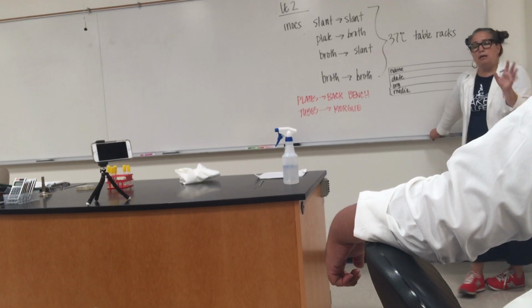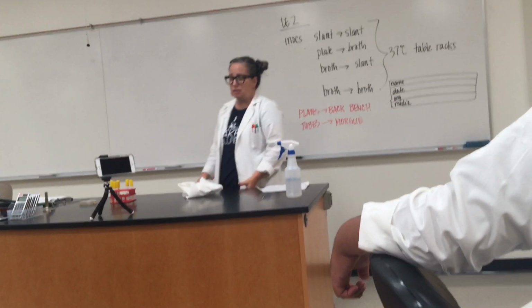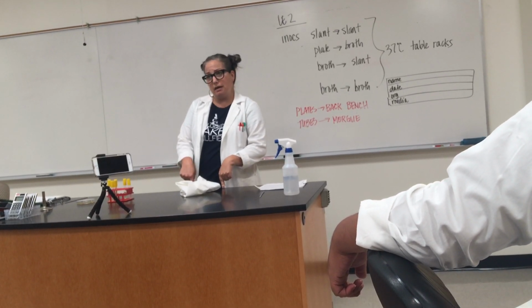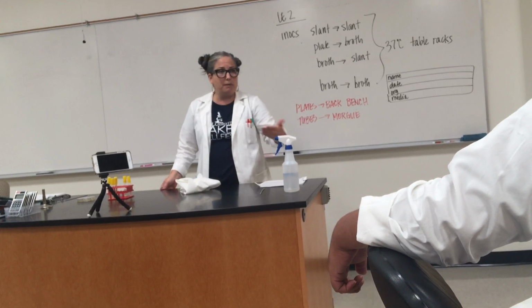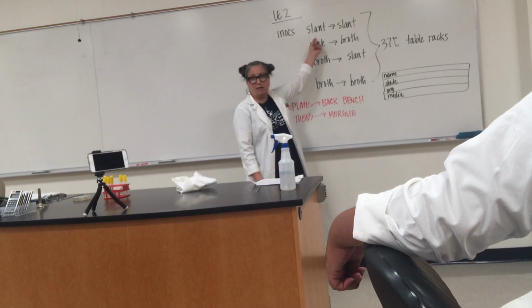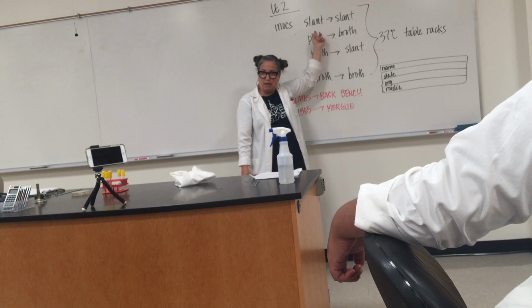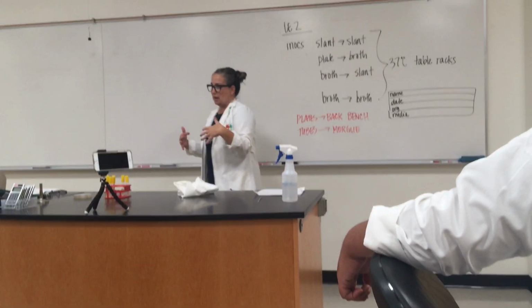Now, why is that? Because if you end up with a contaminated E. coli, I would like to know, did you contaminate it, or was it contaminated when you got it? And the way that I can tell is if multiple people in your team, everybody's contaminated that came from here, then that probably wasn't you, it was probably already contaminated. If you don't tell me which one it is, then it makes it harder for me to track it down.